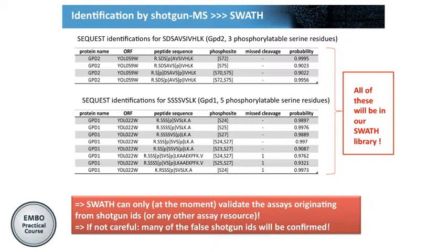Basically we're going to extract several peptides here. Some of them may not be correct peptides, as I've shown you before. One of them actually doesn't exist endogenously, but if we create the assay and we don't think about all the considerations that we discussed, there will be some assay that extracts some transitions as coeluting, which might be just the neighboring phosphoform that we're extracting.